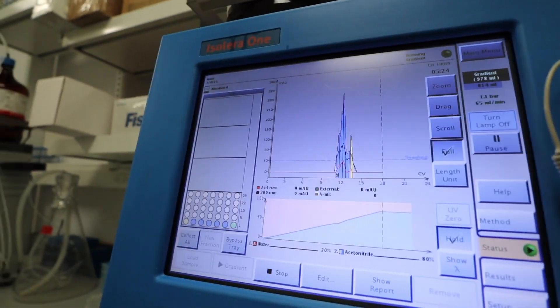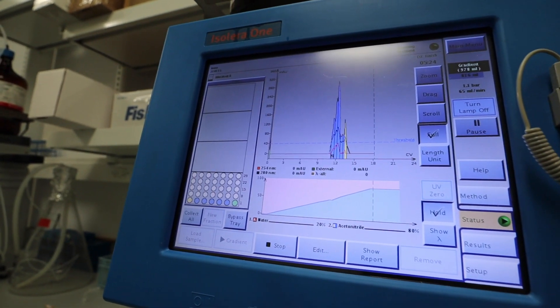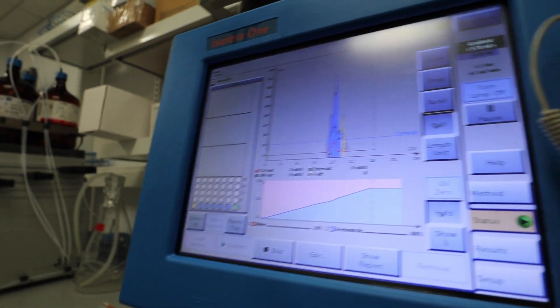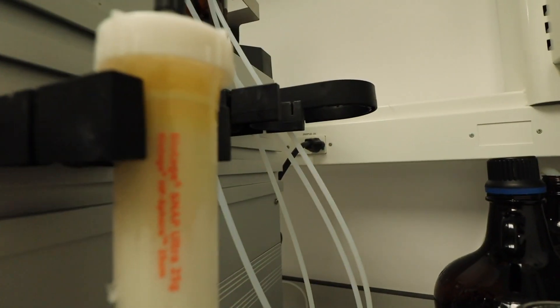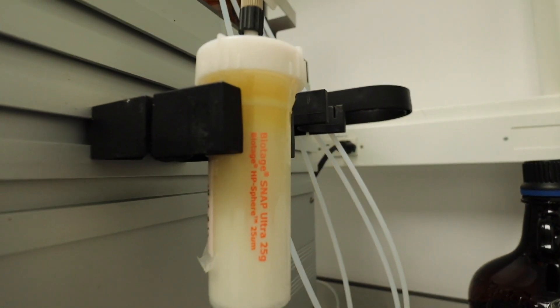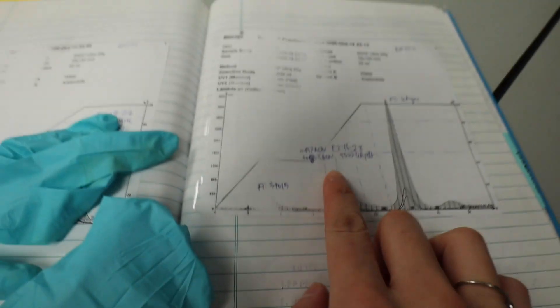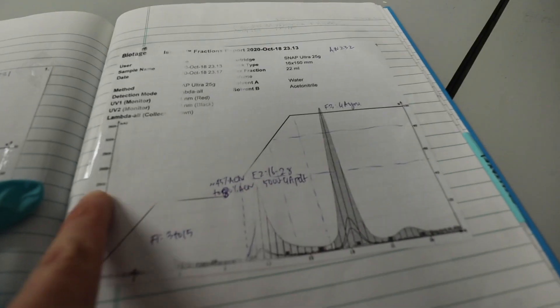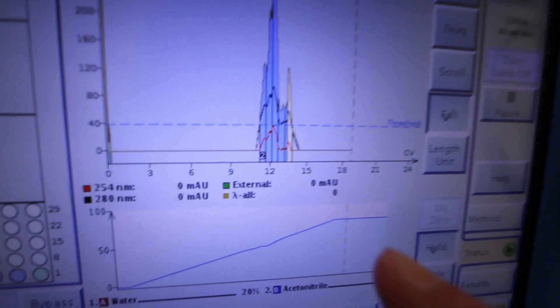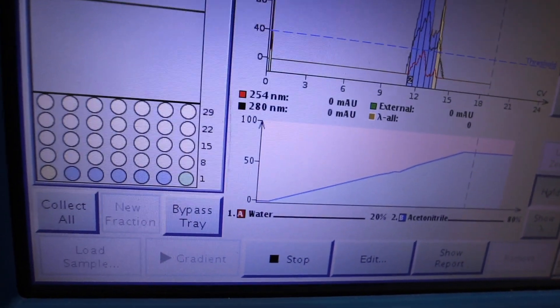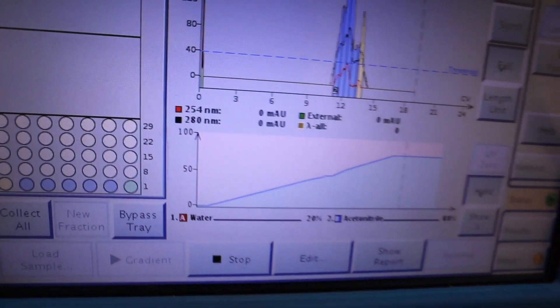I thought that this was my compound but I don't think it's that because my compound I think is still in there. Yeah, from last time it looked more intense. Like this is what, 2000, and this is only 300. I'm gonna hold it at this percent which is 80% acetonitrile. I really hope it comes out though, but man oh man, I do not miss this at all. This is too much anxiety because it's different every single time. Science, science.